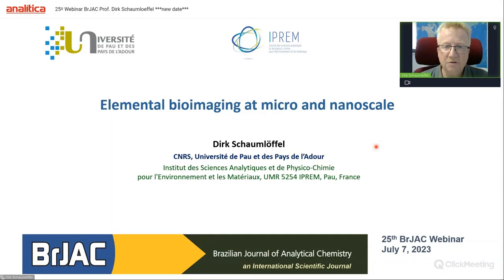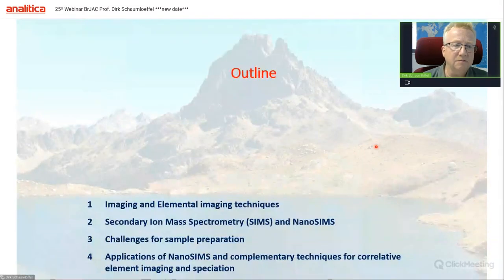So my lecture here is I will give an introduction into imaging in general, and elemental imaging techniques, so imaging in analytical science and element imaging techniques. Then I will focus on secondary ion mass spectrometry as a technique, and then the nanoscale secondary ion mass spectrometry, the NanoSIMS.